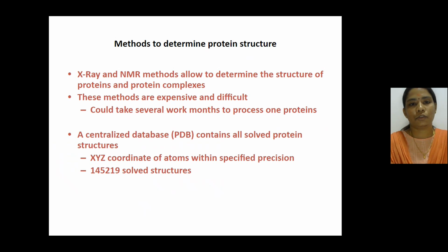Two methods are mainly employed to determine the protein structure, and the experimental procedure is not standard or set. You have to crystallize the protein, or make it in a crystal form. Different experimental conditions have to be followed, so it is trial and error, to set the proper buffer and temperature in order to get good crystals and a proper diffraction pattern.